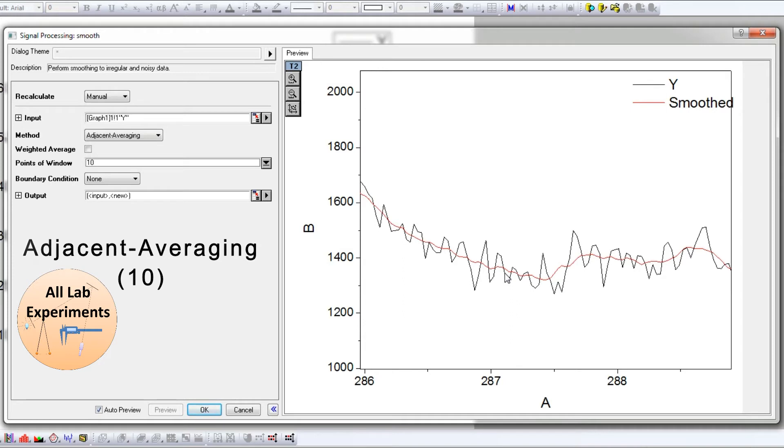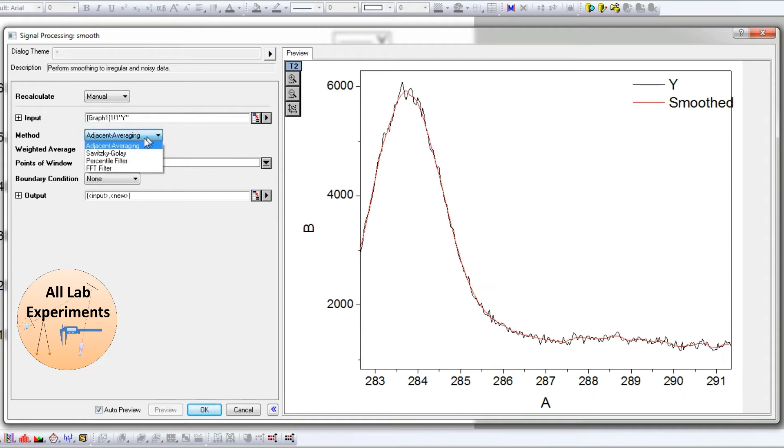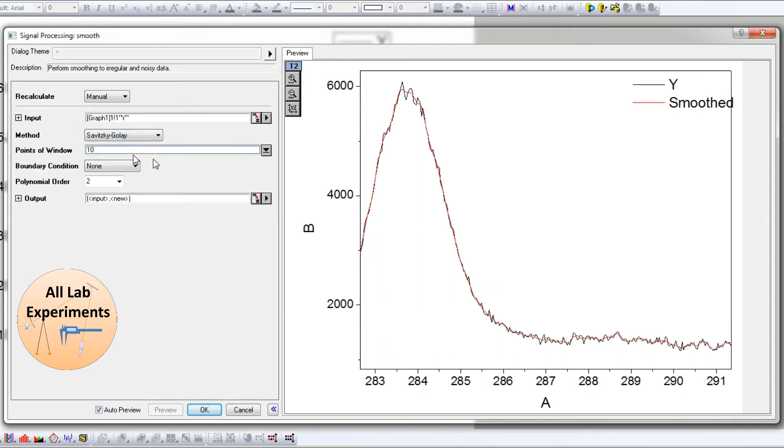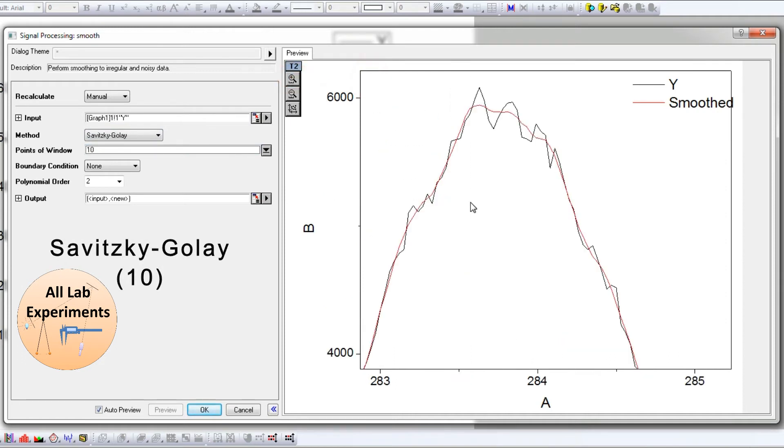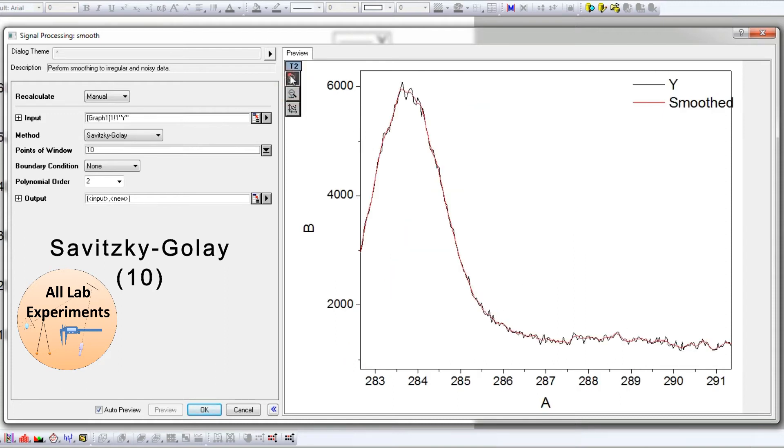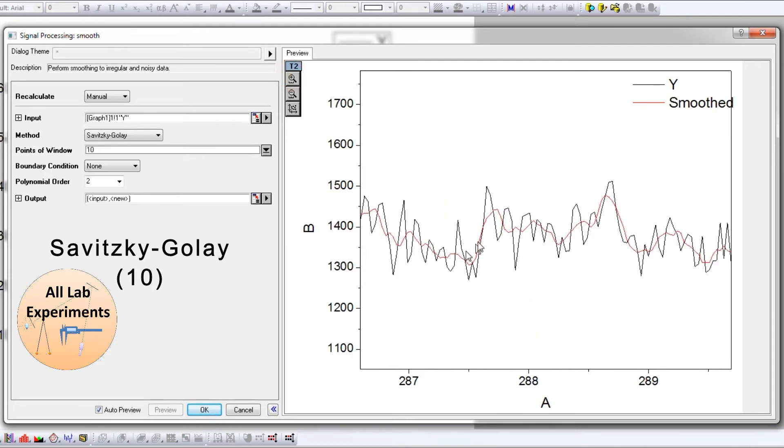In the second region the smoothness has also increased, so we have removed the local noise or any other kind of disturbances from the data. In case of Savitzky-Golay, we will find that this is also somewhat smooth, better than earlier, and the second part is also OK.